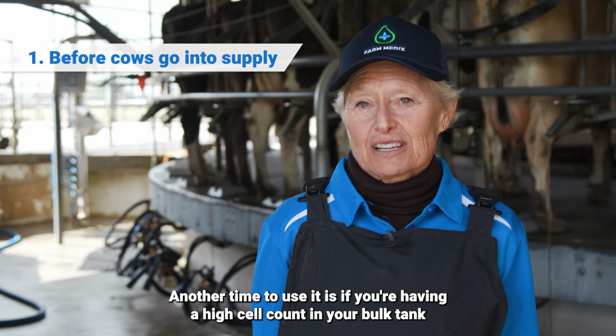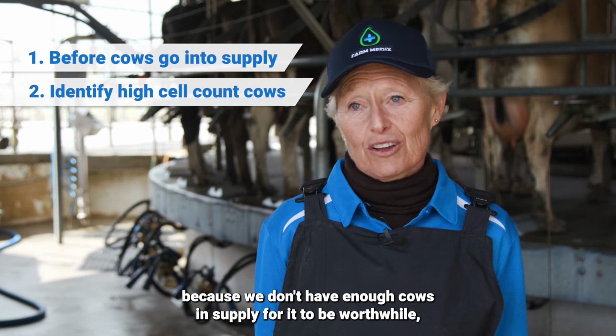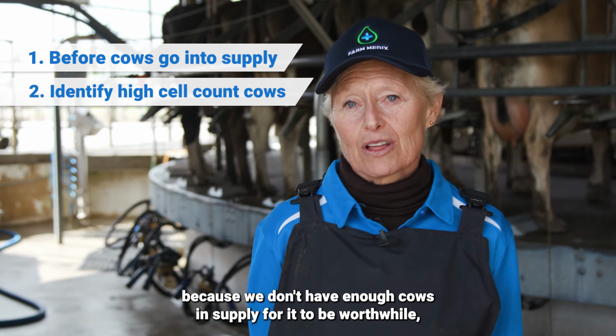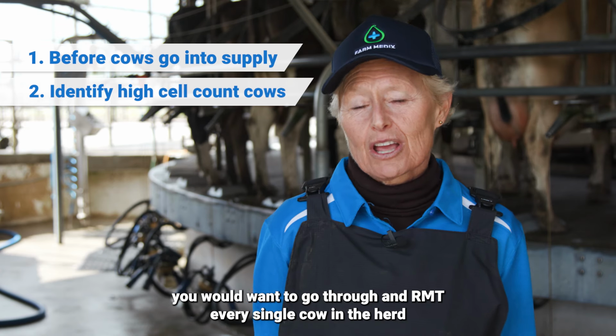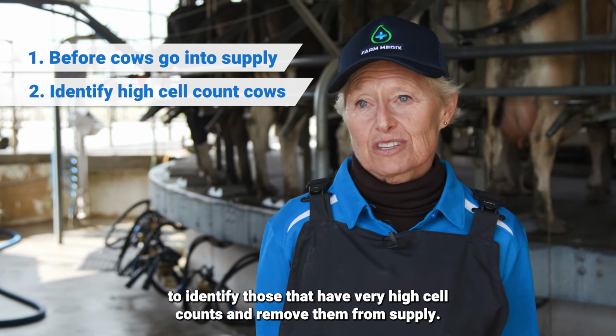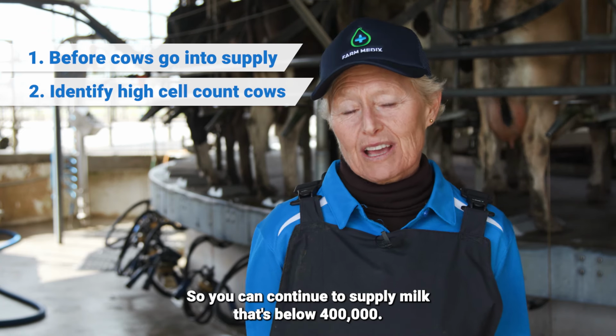Another time to use it is if you're having a high cell count in your bulk tank and you're not going to do a herd test because you don't have enough cows in supply for it to be worthwhile. You would want to go through and RMT every single cow in the herd to identify those that have very high cell counts and remove them from supply so you can continue to supply milk that's below 400,000.